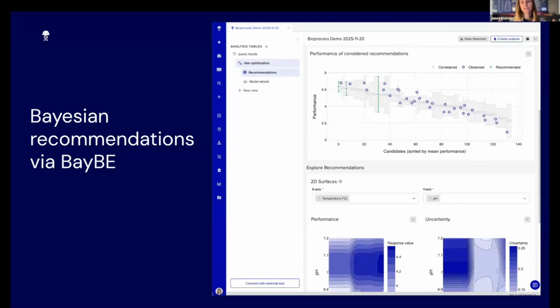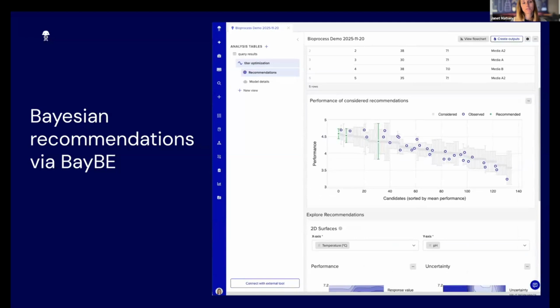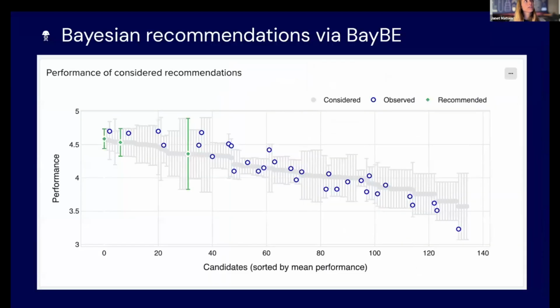And the most exciting killer feature that we've added this year is the Bayesian recommendations, which is built on top of the Bayesian backend. Shout out to the team who's talking later. And for this, we take a best guess at discretizing the user's search space so that we can give them this global view of why a given set of recommendations was picked.